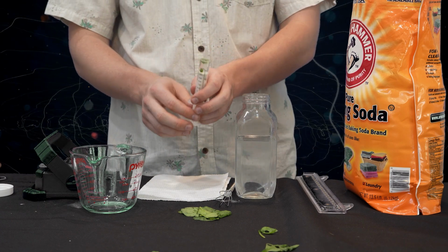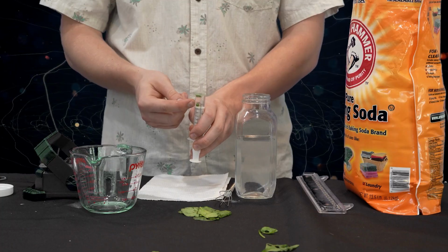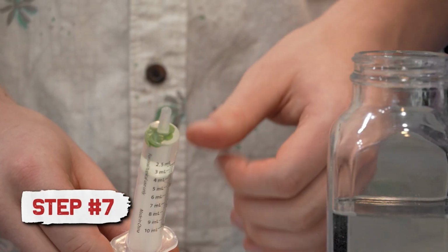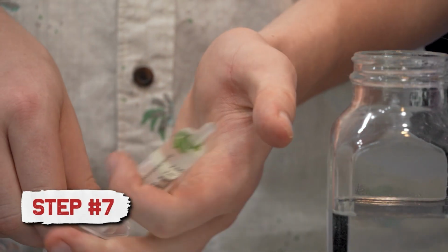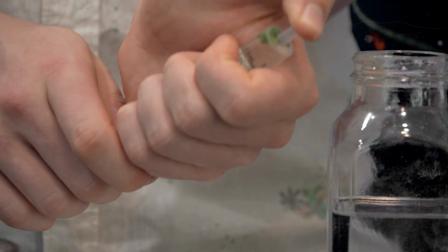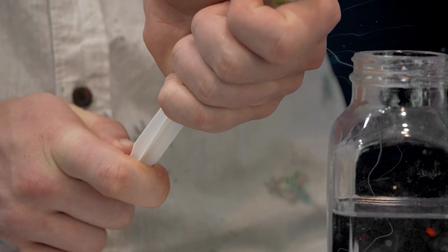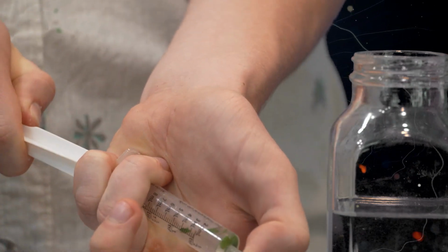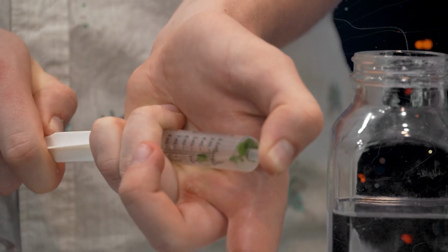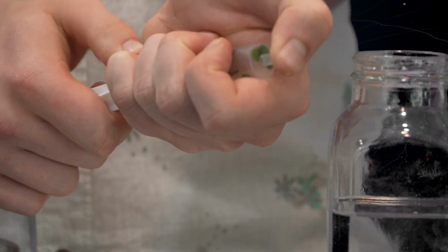And as you can see right now, all of the spinach leaves are floating on the very top of the syringe. So what you're going to do is take your thumb and stick it on the very top of the syringe, just like this. Then on the bottom, we're going to pull out the very end of the syringe. So like this, there's suddenly more space inside of the syringe.